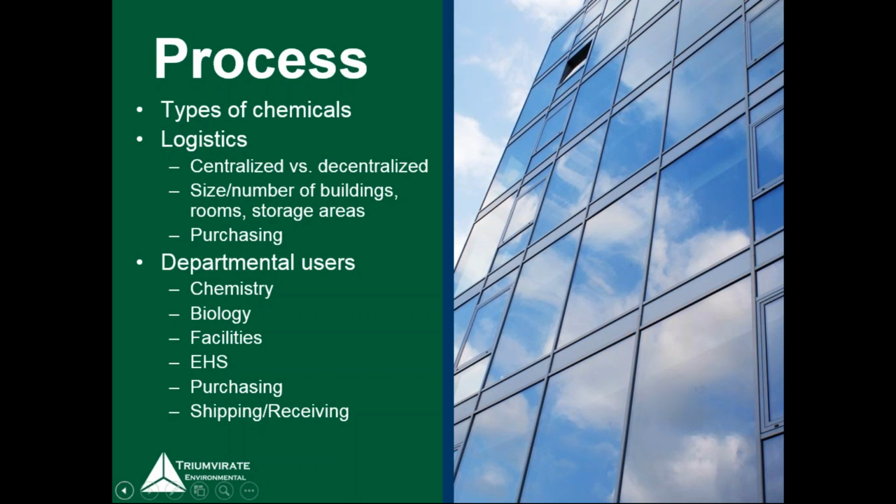So we had to really sit down and assess how we were going to productively do this. We had to locate what I like to call the bottleneck, or the one area where all chemicals are going to go through before they spread out to other buildings or throughout labs, before they get all over your campus. Where are they going to go first? So we traced it back to the source and realized that the only way we were going to see all the chemicals for sure at the same time would be at the warehouse for this company, which was across town.